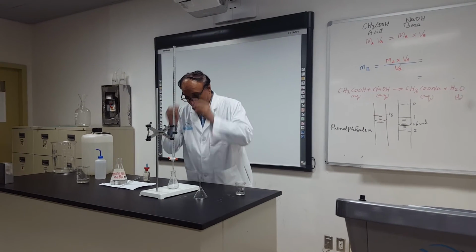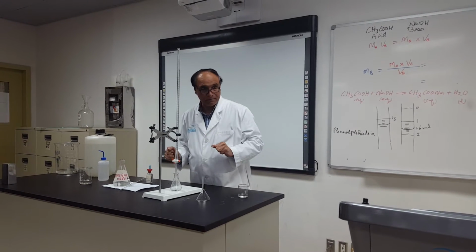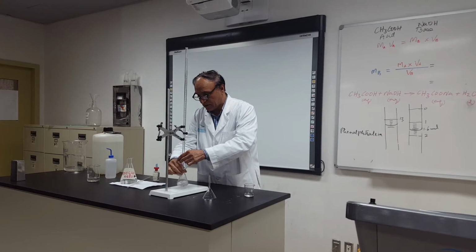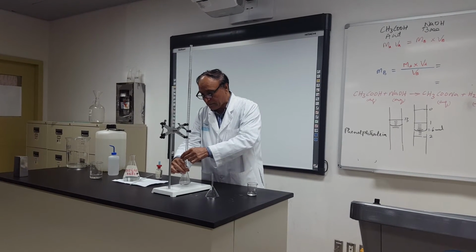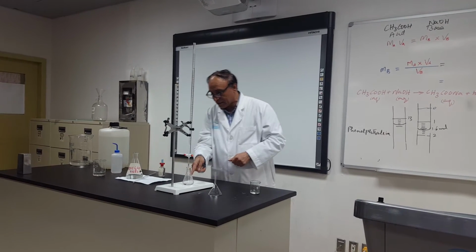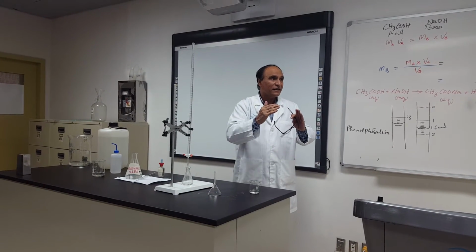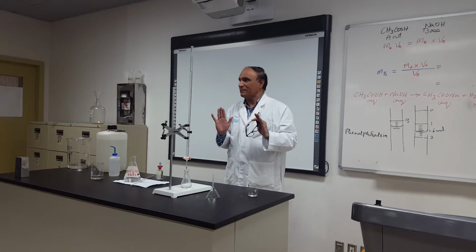And so, I will adjust the speed very slowly. Like that. And I hold it, I can close it, and I am shaking it. As I am putting sodium hydroxide in that, the pink color will come and disappear, but when the end point is near, you can see that the pink color is still there. So when the end point is near, the pink color will disappear little late, which means that you are close to the end point. Did you understand?